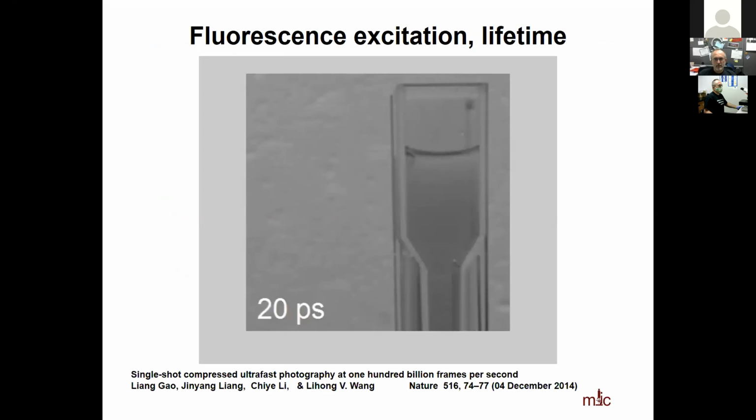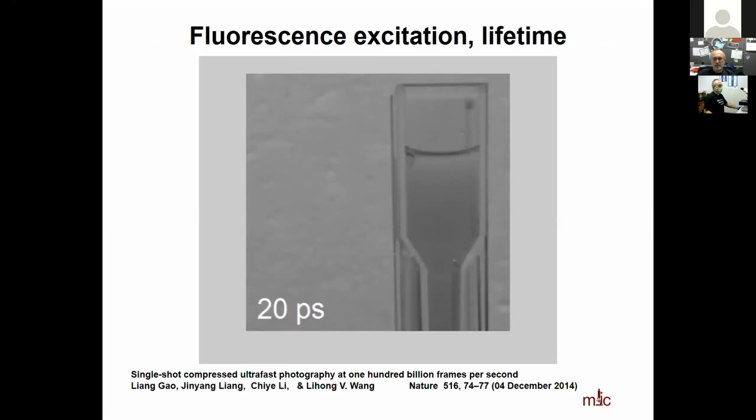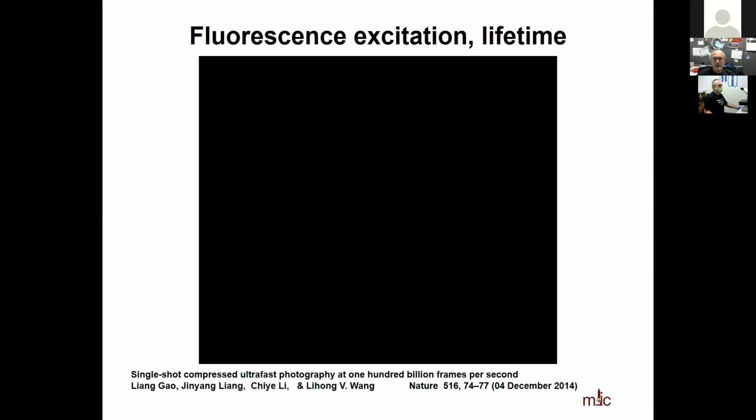So let's see now if this little video will work. So, fluorescence excitation and lifetime. This is a short video that was recorded, there is a citation here, at about 100 billion frames per second, and I think it's really cool. I'll try it once more.